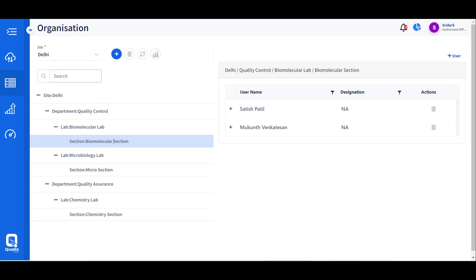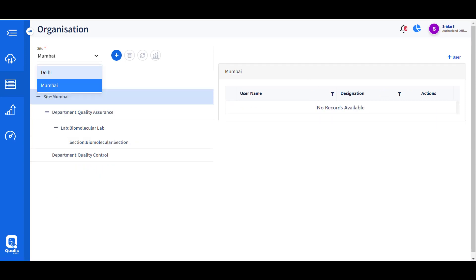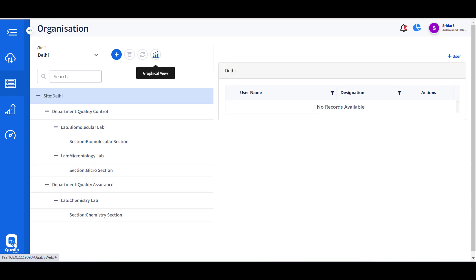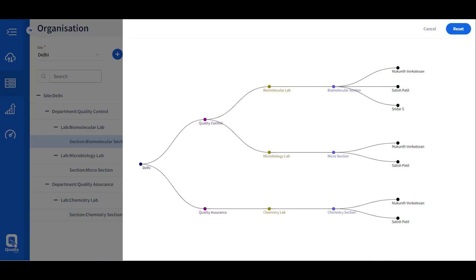Call SLIMS allows definition of an organizational structure which can be drilled down to labs and sections of the labs. Sections are associated with users so that users will have access to specific work areas and tests appropriate to their work areas. The organizational structure can also be viewed in a graphical manner for a quick glance.